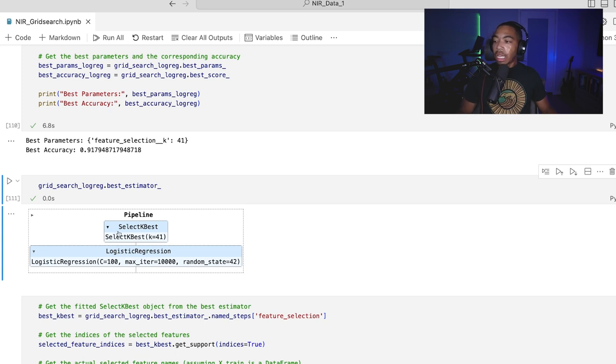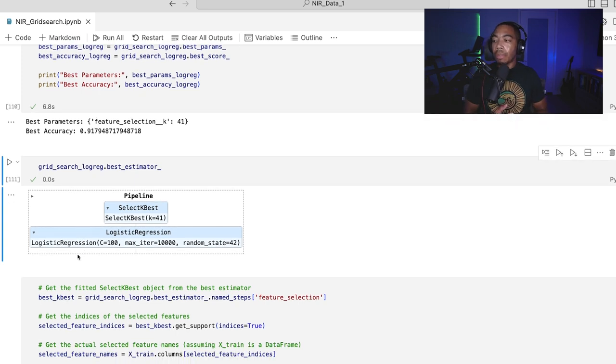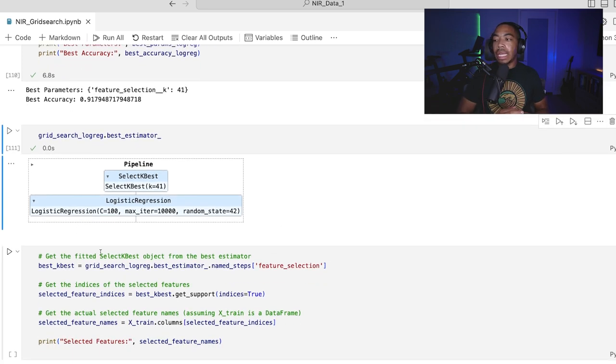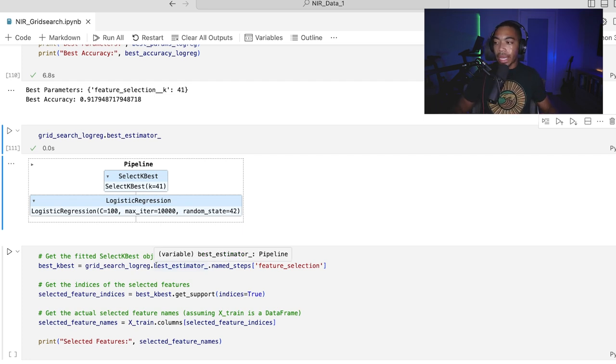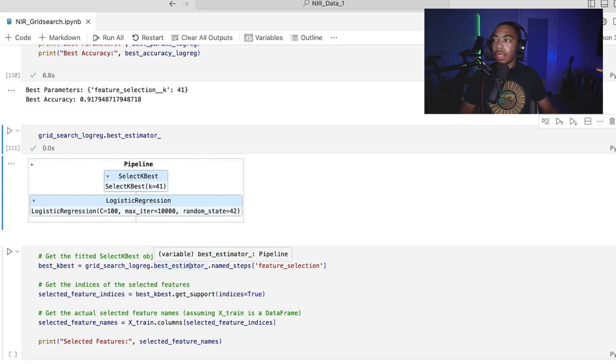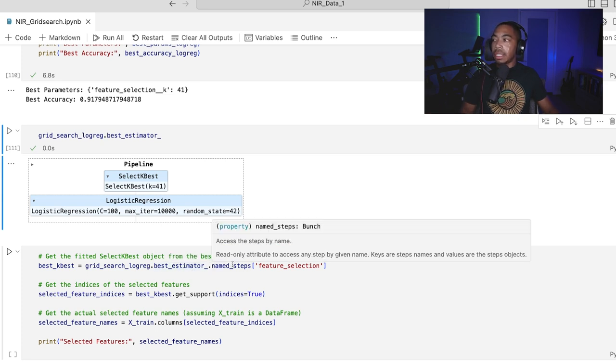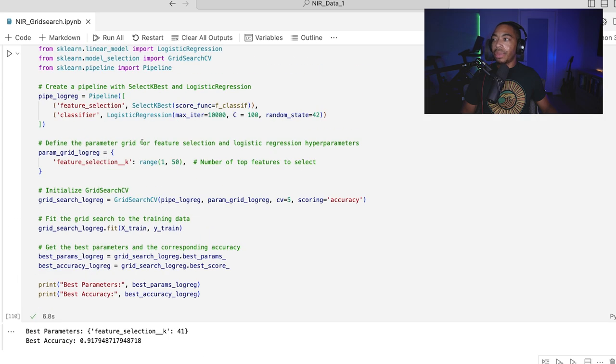So there's a couple other things I want to do to help us to understand the impact of those variables on our data and on our model. And so what I'm going to do is use the best estimator and go into the named steps called feature selection. And that is the step that was indicated by this list here.